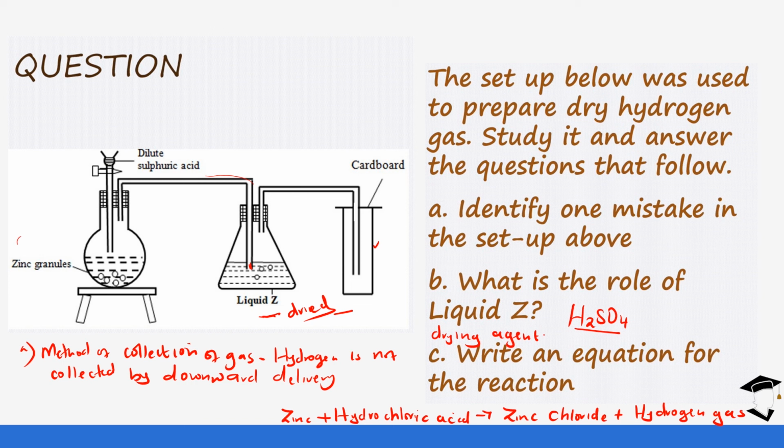And the next thing that we're going to discuss is both physical and chemical properties of this hydrogen gas that we have produced. So make sure you're able to see the reason why some metals are not that suitable, because you do not know which metal is going to be presented for you in the tests. So if you are given some metals that are not suitable, make sure you're able to explain why. And also why some acids, especially dilute nitric 5 acid, is never used because it is a strong oxidizing agent.